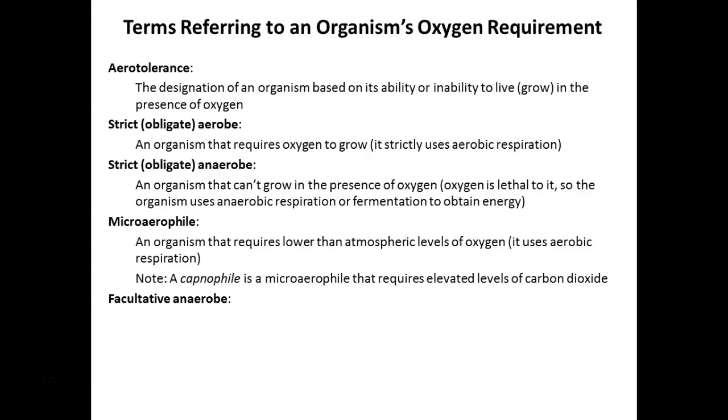And in fact, you generate more energy with aerobic respiration than you do with any other type of respiration. So they grow really well in the presence of oxygen. That's why in that tube I said, oh, that's definitely a facultative anaerobe, because it was growing very abundantly in the presence of oxygen, and its growth was decreased in the non-oxygen anaerobic zone.